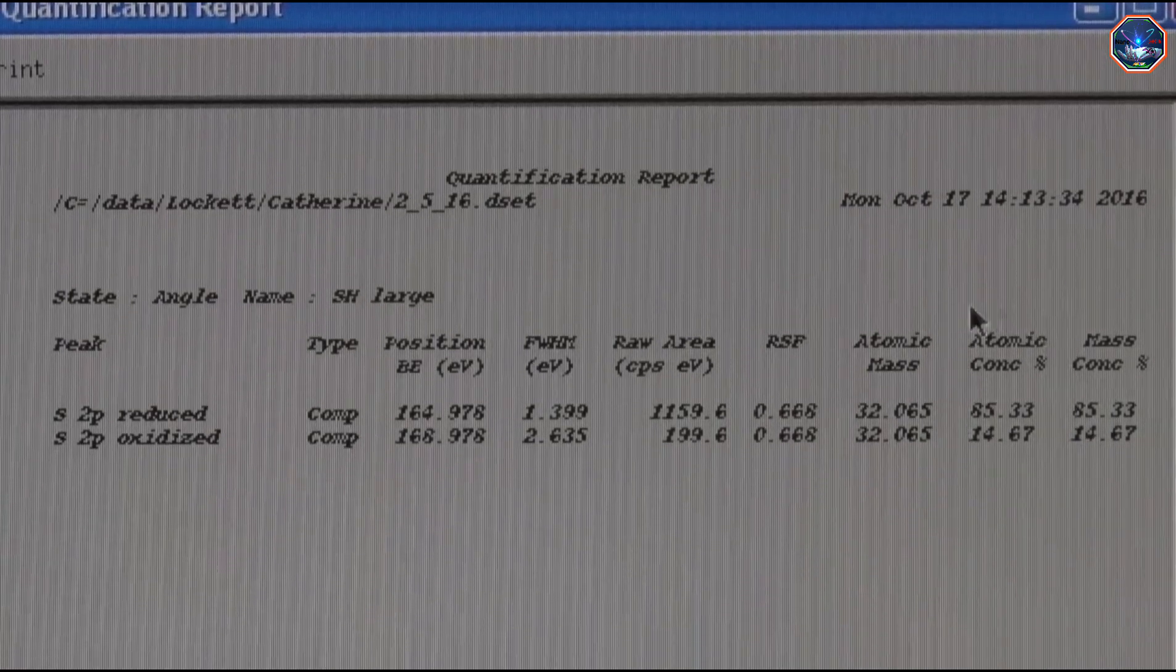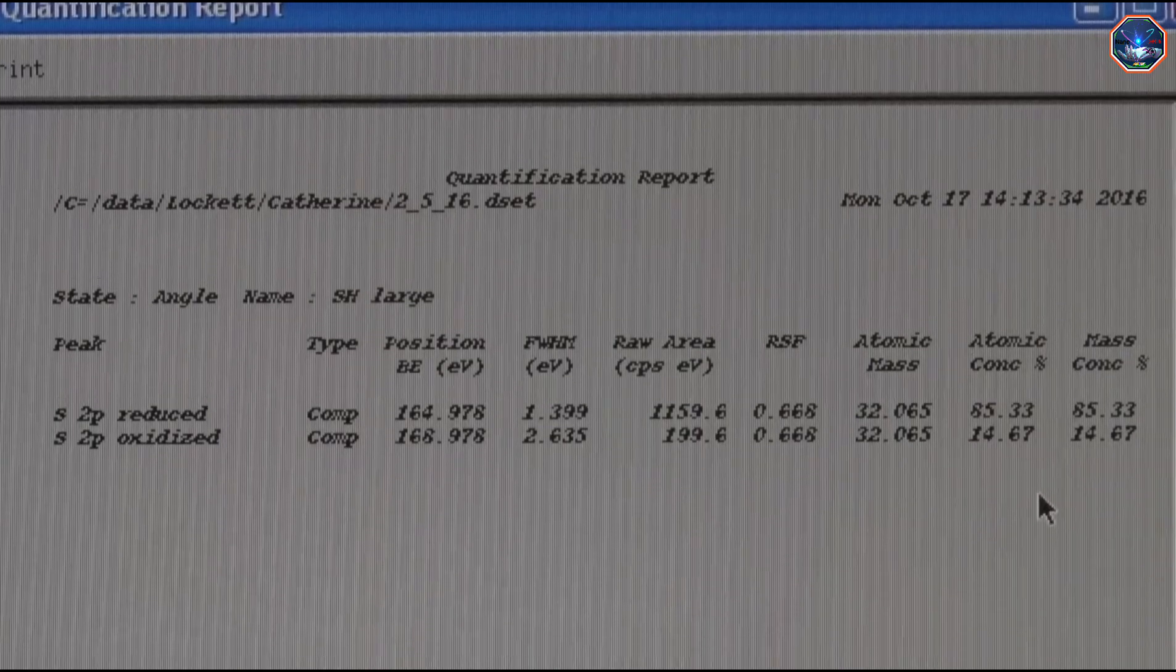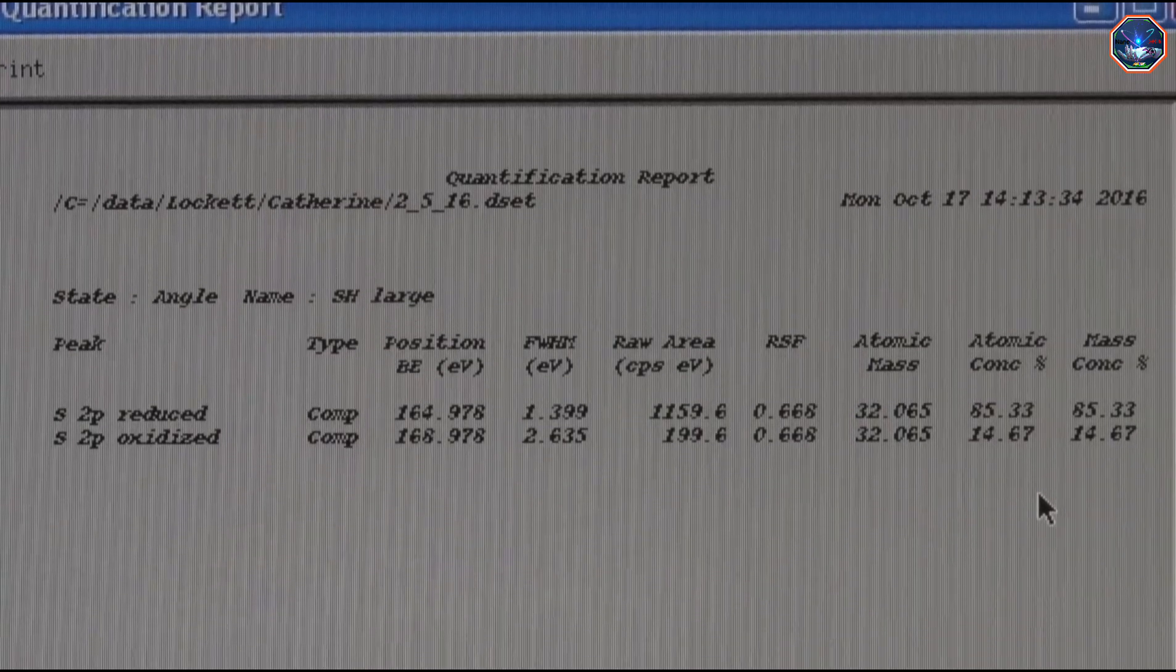This oxidized sulfur is an unwanted byproduct and I'm working on ways to reduce its concentration on the surface of the sample.